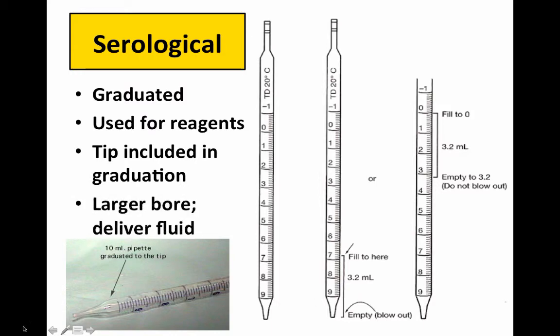Oftentimes you'll find a larger bore in this one too, because you're delivering other fluids, body fluids, that kind of thing. So we can use it for reagents, but like I said, it is also able to be used for samples.